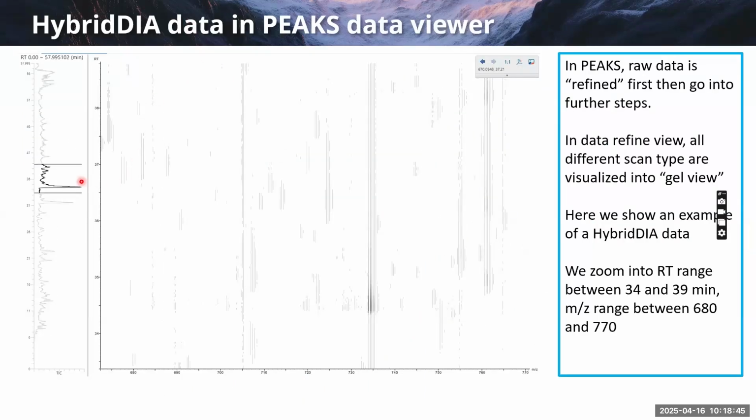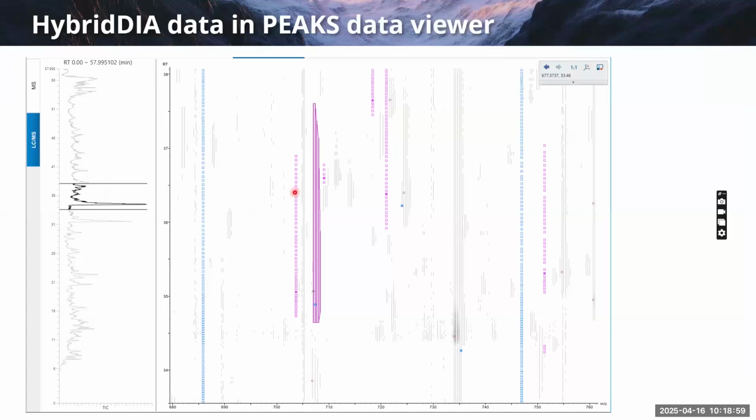So this is a small time region, around 36 to 37 minutes, and here is our peak. Basically, the first thing we make sure of is that here we have a target peptide. Since it's our spiked peptide, it is usually the isotope labeled one, and the intensity is very high, so we will easily find this.